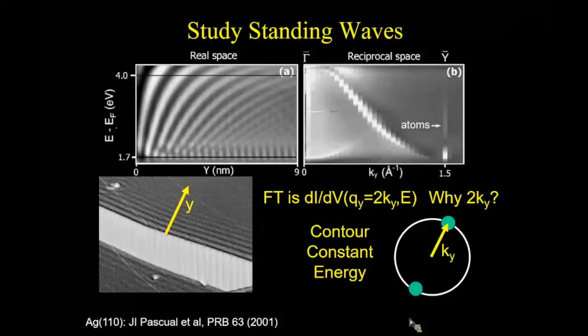When you have a step edge, you're really just looking at one dimension, which is the dimension perpendicular to the step edge. If you sprinkle impurities randomly through a material, then you get scattering in every direction, and you can actually sample the Fermi surface in all directions. And so we've mapped out, for example, the Fermi surface of high-temperature superconductors using this technique. You can map out other systems, topological insulators, for example. Vidya Madhavan's group has done this and looked at the absence of backscattering in topological insulators. So it's a really powerful technique for doing K-space investigations with a real space technique.